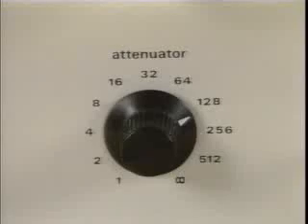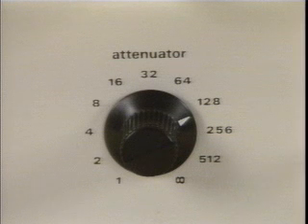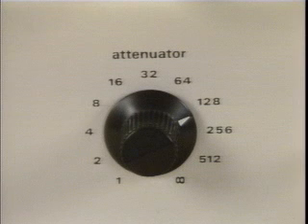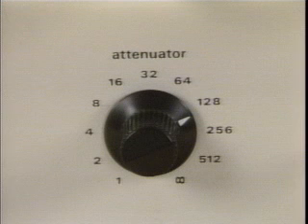The attenuator knob on the recorder regulates the ratio of the pen response to the detected signal. To ensure a quantitative analysis of the sample, the knob must be set before the sample is injected. An increase in the attenuator setting results in a decrease in the pen response. Doubling the attenuator setting will halve the pen response.